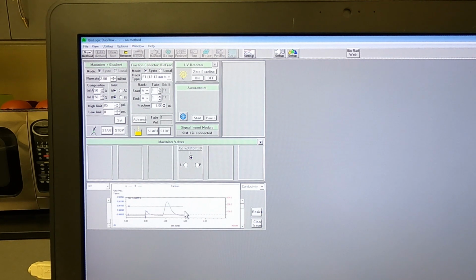This is the same process when you switch over between any buffers. So if we're sitting in 20% ethanol and then we're switching over to water to flush the ethanol out, we'll repeat this process. And then the same thing when we go to equilibrate, right? Our system will be in water, but we want it to be in our Tris buffering system. So we'll repeat this flushing process.